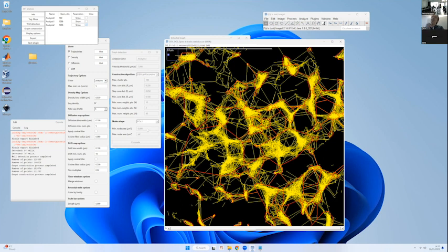So yeah, there's one more thing I want to say generally on the plugin. So you've seen there's a lot of parameter optimization. It's not necessarily very convenient to do it by hand. So there's a programming interface to this whole thing that you can access through ImageJ.